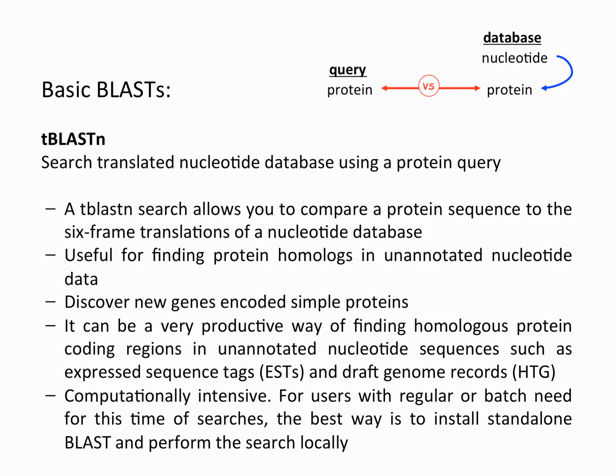The T-BLAST-N searches translated nucleotide databases using a protein query. ESTs, or expressed sequence tags, are short, single-read cDNA sequences.